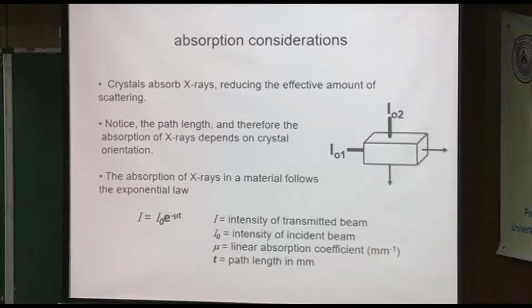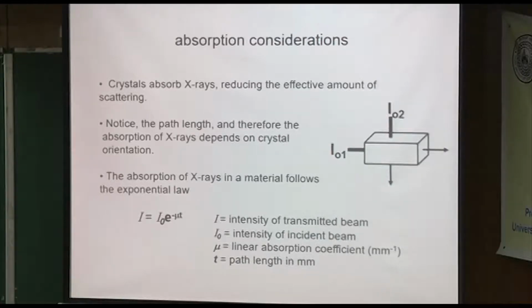Okay, so absorption considerations. Some people have dual instruments. I don't know if you guys here have access to a dual instrument, do you? One that switches between copper and molybdenum radiation? No? Okay. We have two of them in our lab.